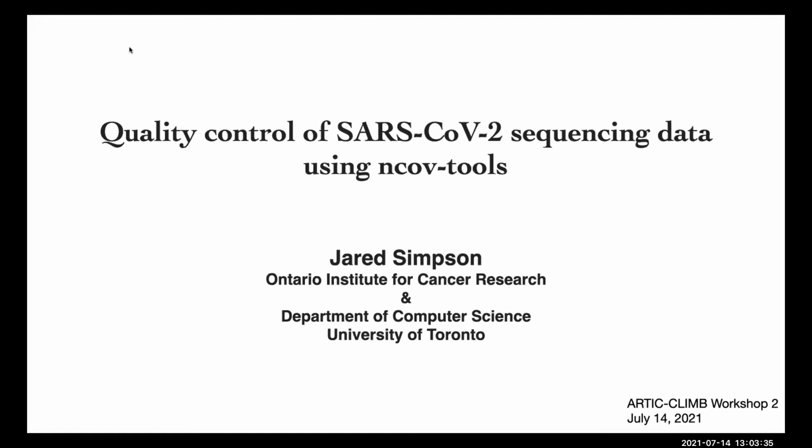Great, thanks Nick for the introduction. Really happy to be here and share what we've learned. So as Nick mentioned, I'm going to give sort of the perspective of what we're doing for quality control here in Canada for Cancogen, and focus mainly on this toolkit that we've been developing in my group, mainly led by Richard DeBorgia, who's on this call here today, called ncov-tools, which is the package we use to run on all sequencing data generated here in Canada to ensure that it's high quality before releasing to the public community.